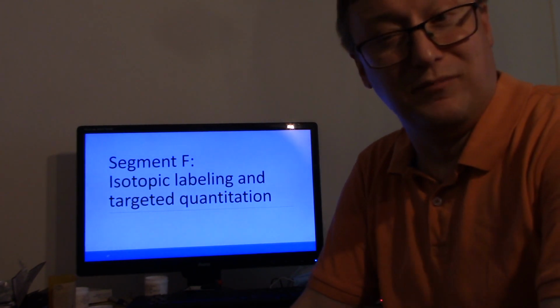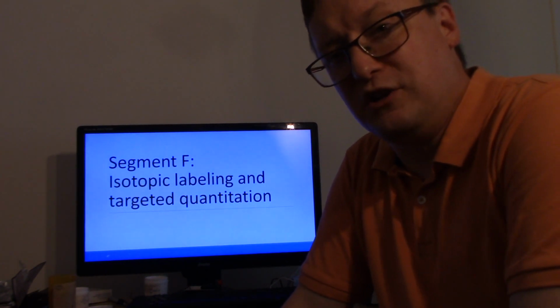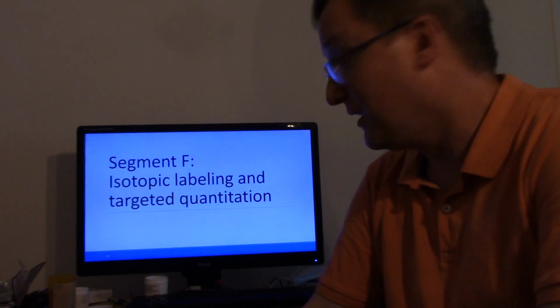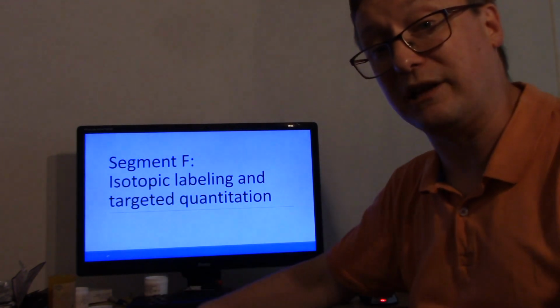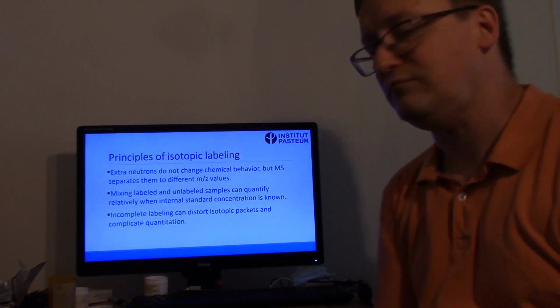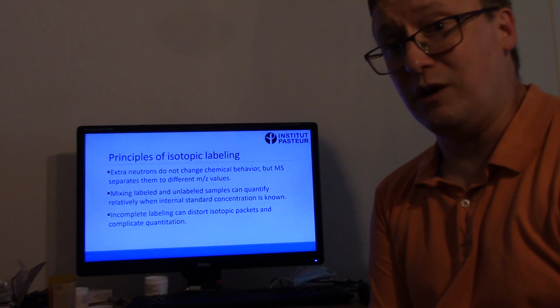And we're back. Let us make some discussion now of more advanced techniques for proteomic quantitation. For this, we're going to talk about isotopic labeling and targeted quantitation. Some basic principles, though, before we start.